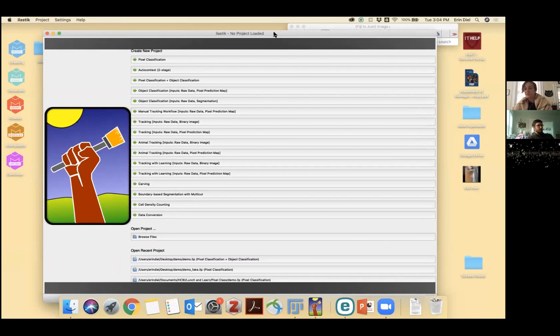All of you, of course, have access when the facility is open or via remote access to any of the workstations because those have a license for Zen. But let's say you want to be able to do it on your home computer, or you already are using, let's say, Fiji or some other software, and you want to implement some open source solution for machine learning based segmentation. I just want to give a couple of examples of other options. And this is much broader than just the couple of examples that I will show you.